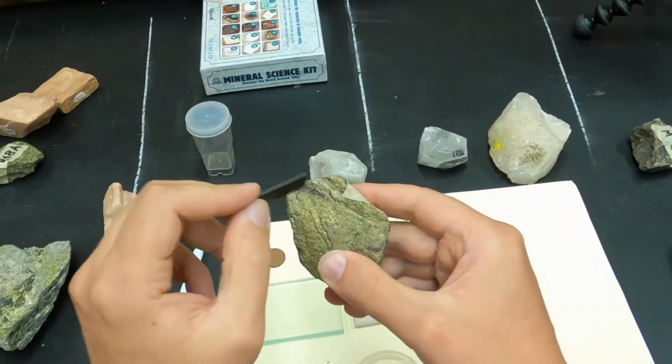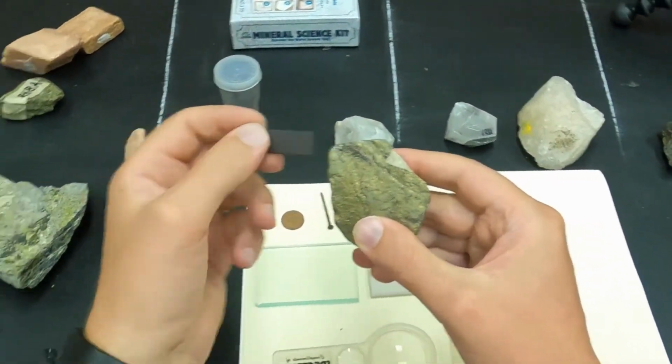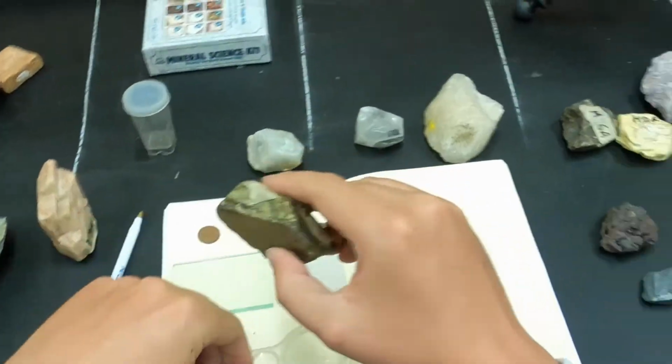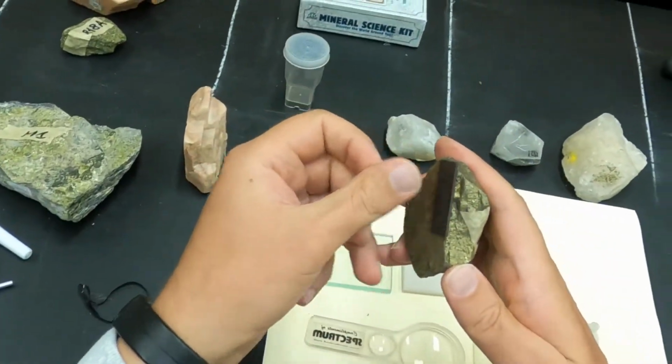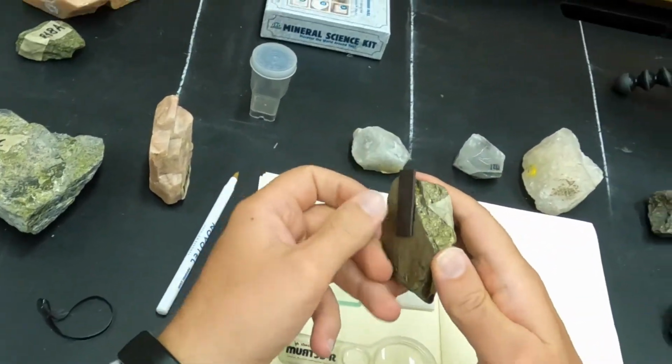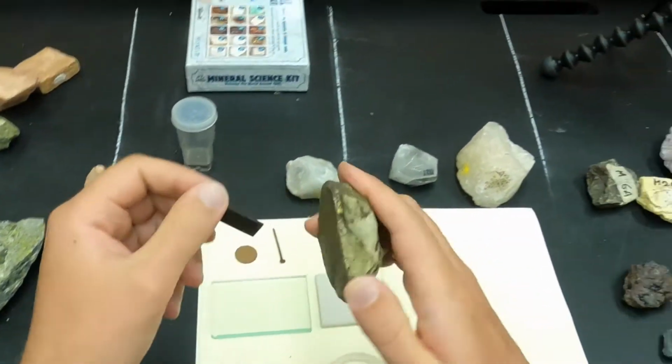And pyrrhotite is partly magnetic, it's weakly magnetic, so you can test for that in pretty much the same fashion. You will realize that the magnet doesn't stick as well, but it does still stick.